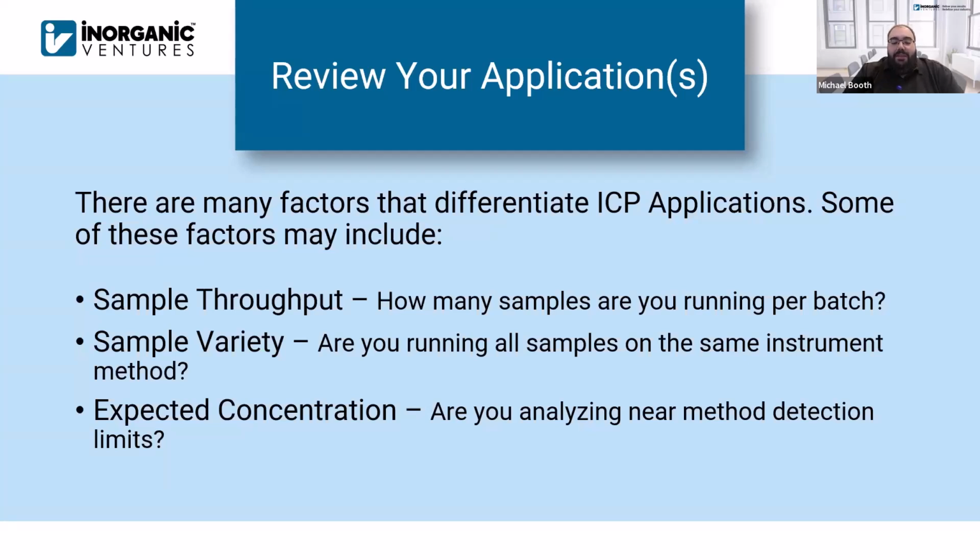What's the overall experience of you or your analysts, and what's their comfortability level with preparing standards? That's something to keep in mind. So there are other factors that go along with these different applications that are more on a global, lab-based level at the same time. So all of those factors you want to keep in mind as you select an appropriate standard.